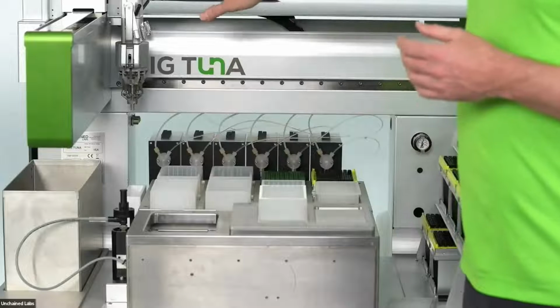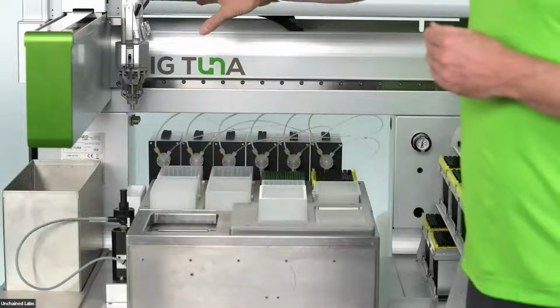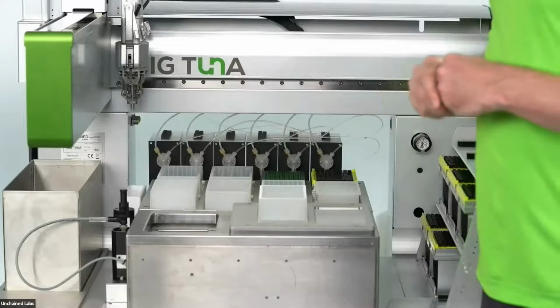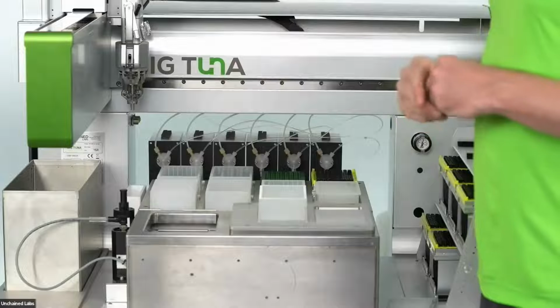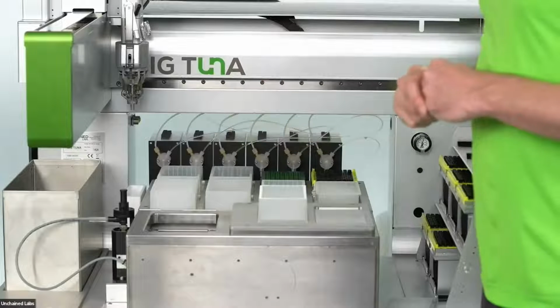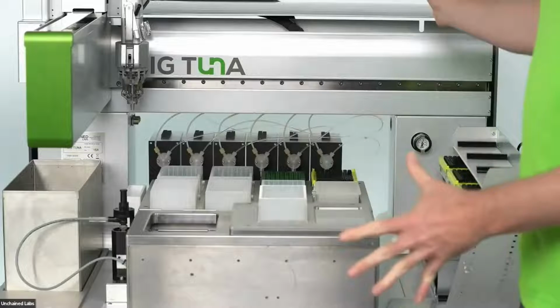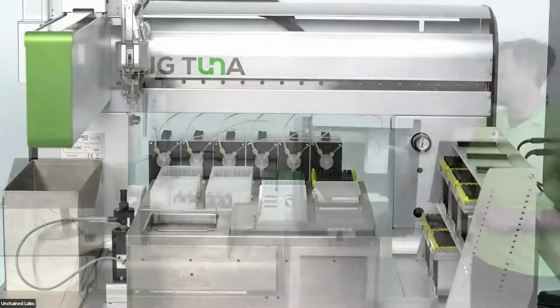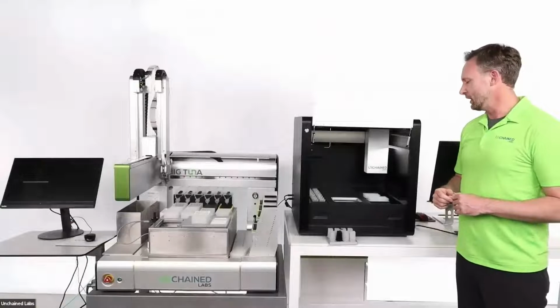So you'll see it in action a little bit later, but here is the arm. The gripper is on the right side that picks up the ultrasonic volume sensor. And then you have 6 channels on the other side of the arm that do all of the aspirations and dispenses that Big Tuna needs. So there's the big boy, Big Tuna. Let's switch over to Unagi, everybody's favorite benchtop buffer exchange solution.